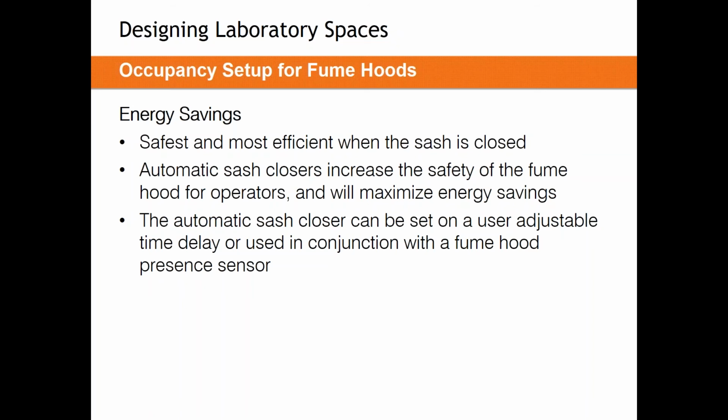Most fume hood controls manufacturers can help you with monitoring sash position. So if you install a sash position sensor or a sidewall sensor, you can get a really good estimation of how open your sash is. You could, for example, pull that at 2 a.m. or 3 a.m. when nobody should be working. If you're seeing a large amount of fume hoods open any given night, you can relay that information back to those research teams. You can tell them exactly how much energy they're expending. That might help them close the fume hoods.